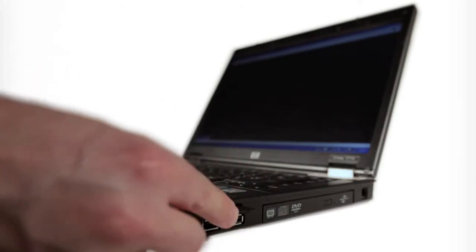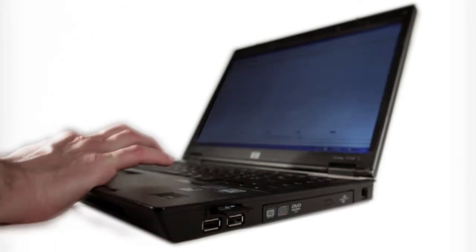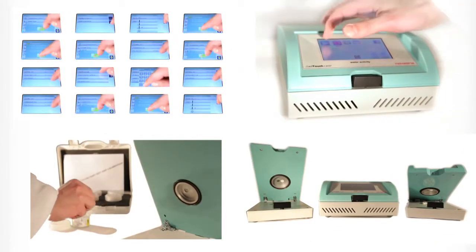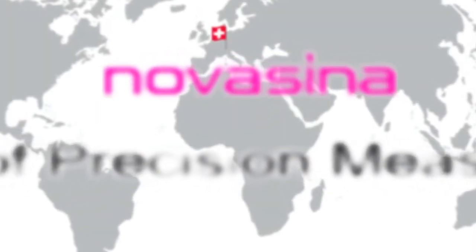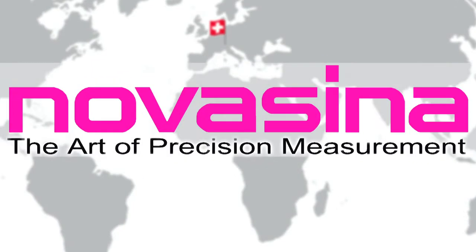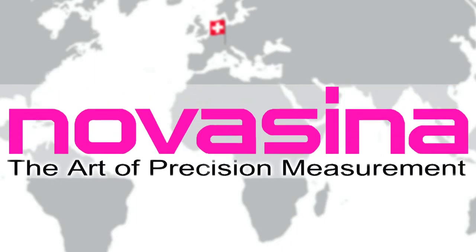Another feature is the SD card for data storage and transfer to visualization software, which makes the LabTouch versatile and flexible. Novasina, your expert when measurement matters, worldwide.